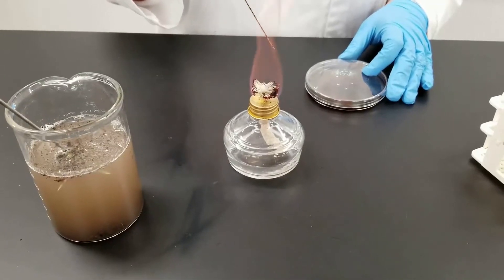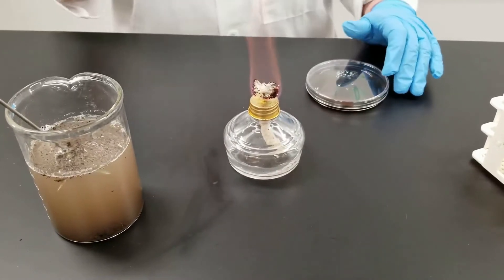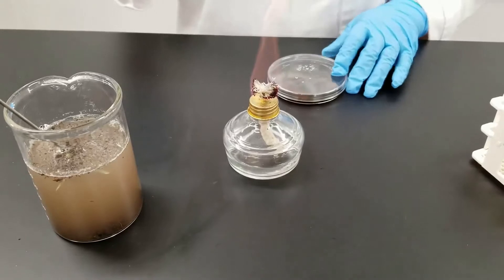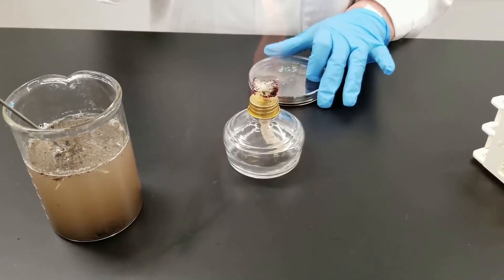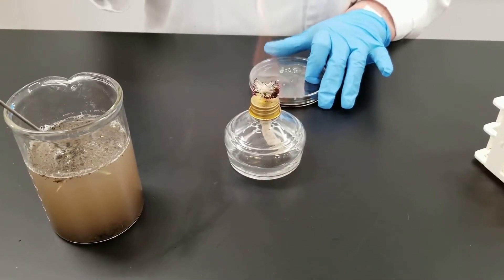We're going to be testing the microbiology in water. We have a water sample here. We're going to, in a different lab, be inoculating tubes — lactose tubes — to determine the most probable number.